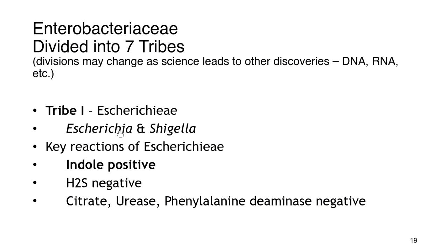Key reactions about Escherichiae. We're talking about the family for both Escherichia and Shigella. The test is called indole positive. Again, you were briefly introduced to various tests last week in the PowerPoint, and in your textbook you will explore some of those in the hands-on lab time later on.